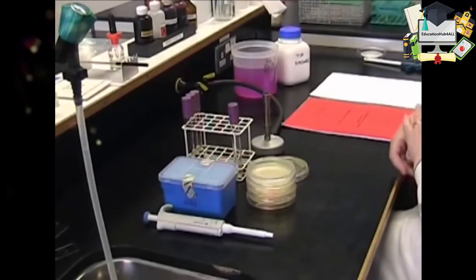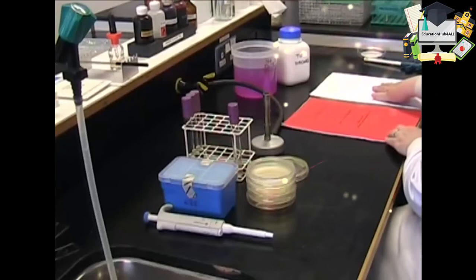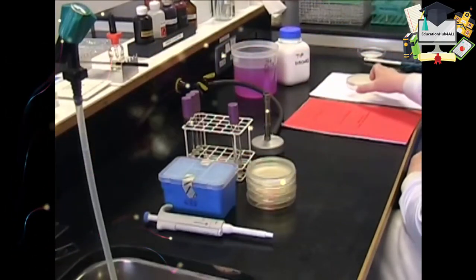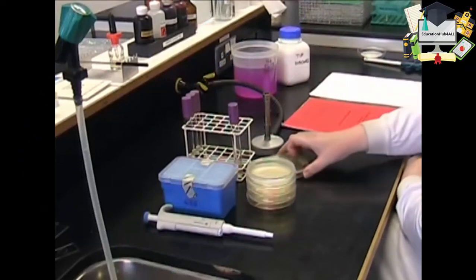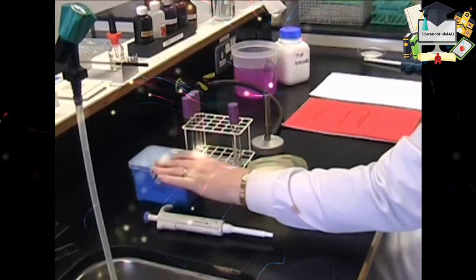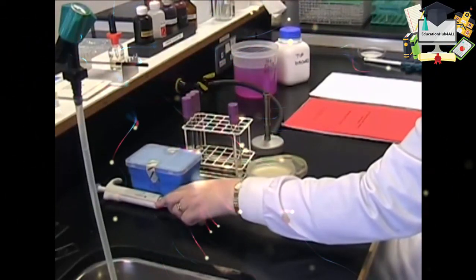It's important to work safely when you're working in a lab. Keep your lab books and your notebooks away from your work, and remember never to place your plates on top of these because there could be a risk of contamination. So try and work as tidily as possible. If you have equipment you don't need till later on in the session, perhaps move it to the back of the bench to give yourself a bit more room.